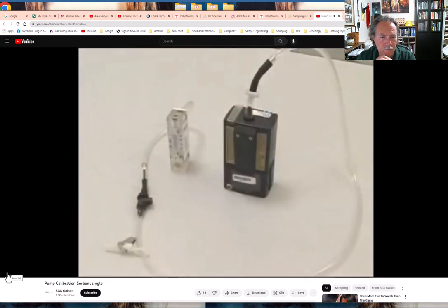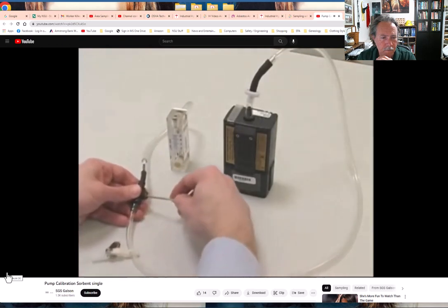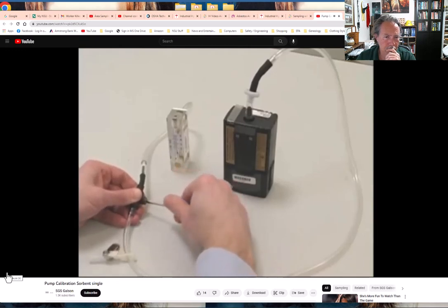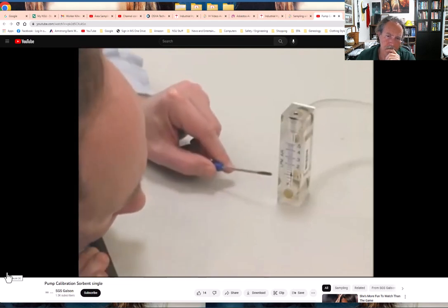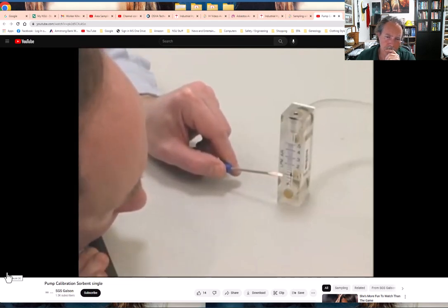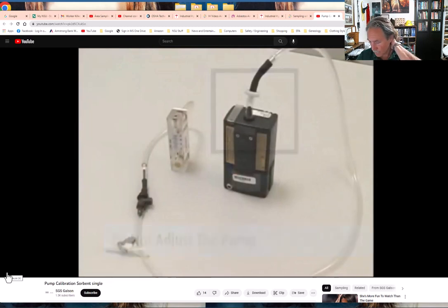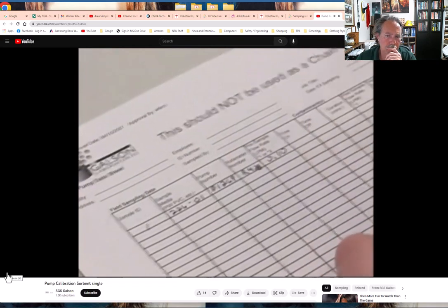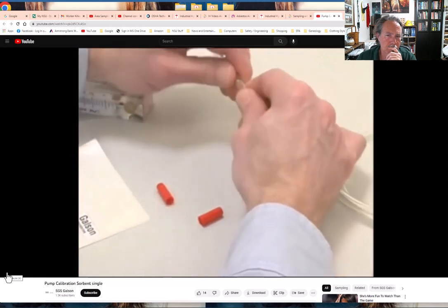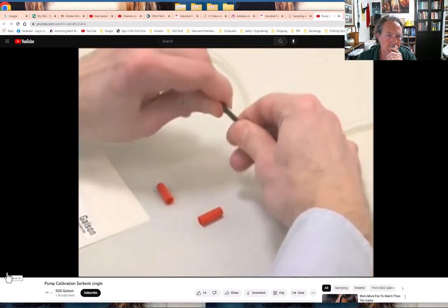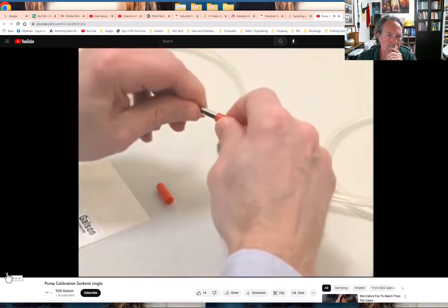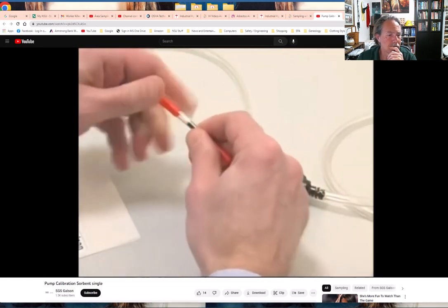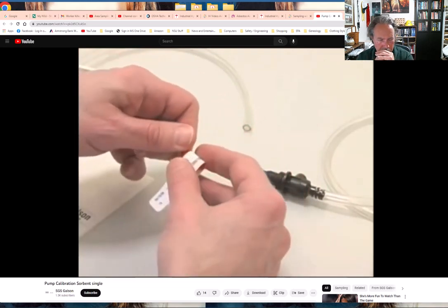Do not adjust the pump itself while verifying calibrations — only the low flow holder should be adjusted. With everything on a level flat surface, check the ball float in the rotometer. Adjust the flow rate by turning the flow adjustment screw on the adjustable low flow holder until the rotometer indicates the desired flow. Take your rotometer reading at eye level and use the center of the float. After you're satisfied with the flow rate, record the value on the field pump data sheet and remove the sorbent tube. Cap both ends and mark it for use in the post calibration.